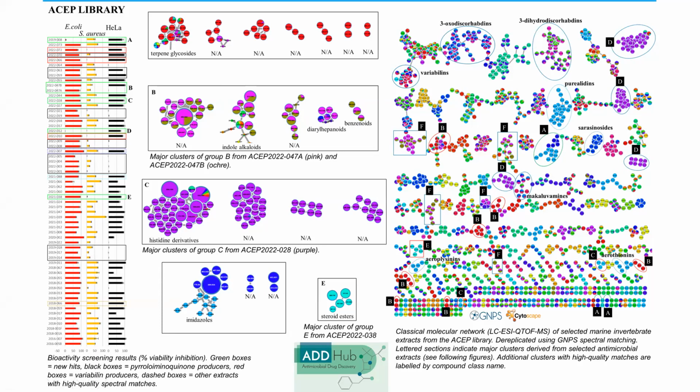molecular networking from the tandem mass spectrometry correspond to which compounds, which sponges have the same metabolomic profiles, which ones have different ones, and use that to inform our steps in terms of purification, because that's our final goal. We also do on-site here, compound purification.